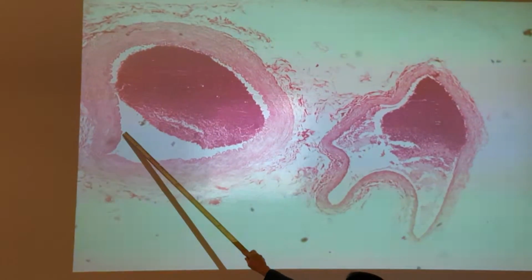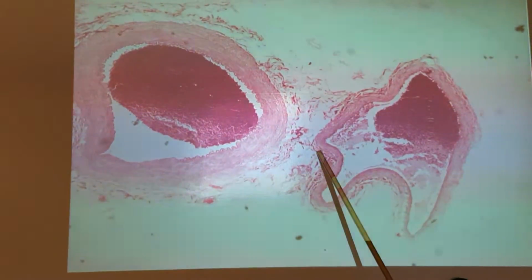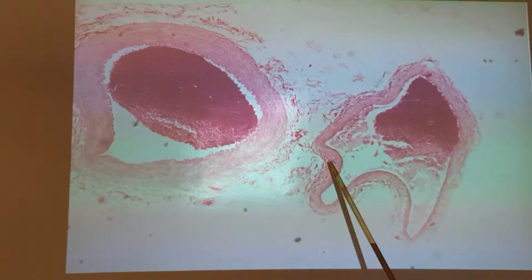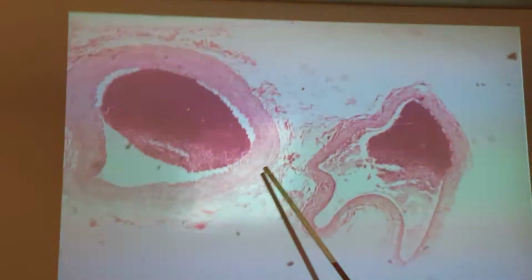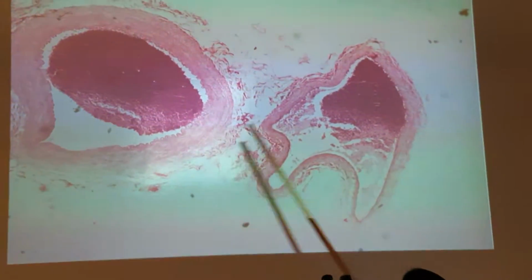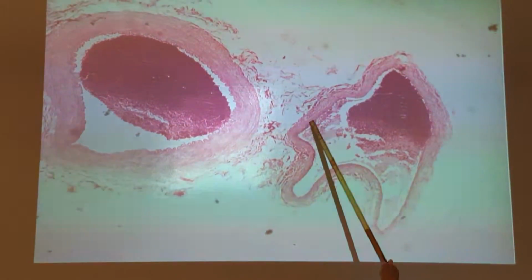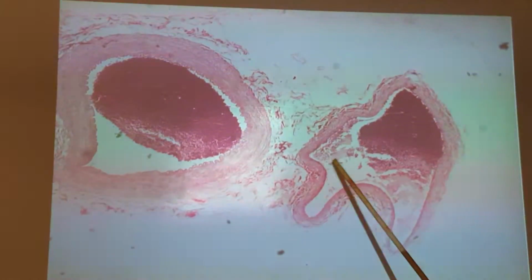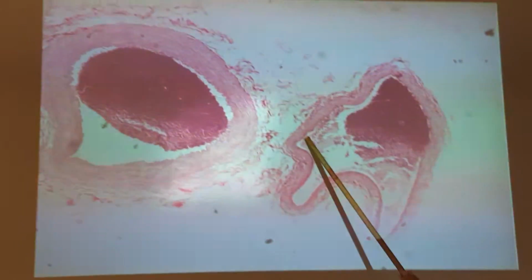Tunica intima, right here. Tunica externa, this one. Tunica media. How about this? Tunica externa. How about this right here? Tunica media. And then this way, the lumen. Oh, tunica intima.